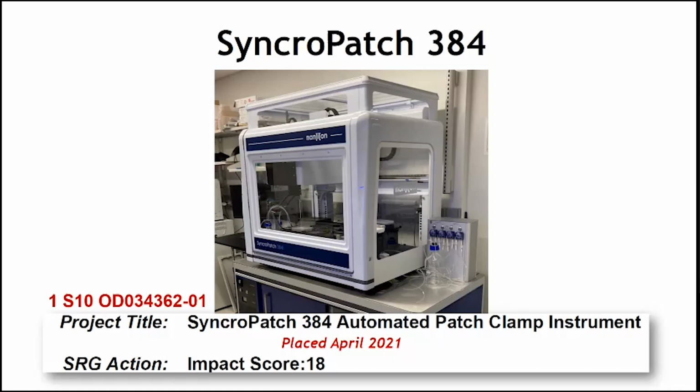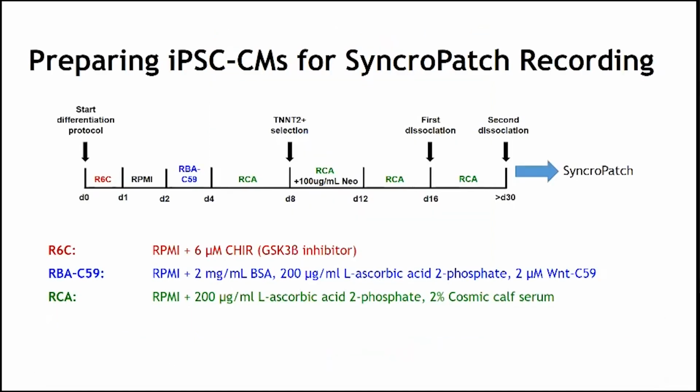just sodium currents and other things under voltage clamp conditions, but we've been able to begin to optimize use of this cellular platform for measuring action potentials. In order to do that, there's been a tight collaboration between my lab and that of Paul Burridge, and I want to highlight the work of postdoc in Paul's lab, Mallory Blankard, who's worked closely with Carlos Benoit in my lab to really optimize the culture conditions necessary to get robust currents recorded and action potentials recorded on this platform.